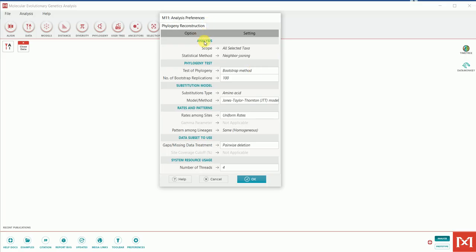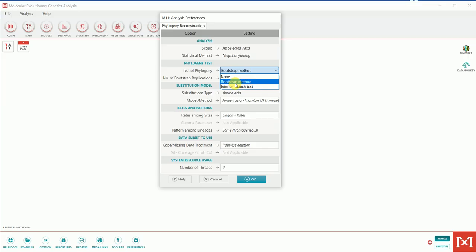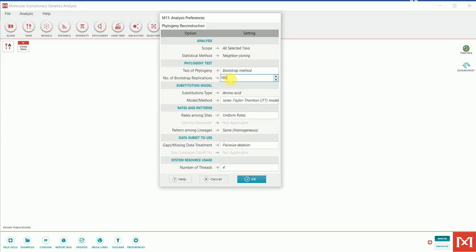Now, the phylogeny test settings are really important. The bootstrap method should already be selected, but if you're using the program for the first time you may need to select it manually — go to the test option and choose 'Bootstrap Method' rather than 'Interior Branch Test' or 'None.' The bootstrap value gives confidence in the branches created. The higher the number of replications the better; publications often use 1000, but for demonstration I'll keep it at 100. Then press OK.